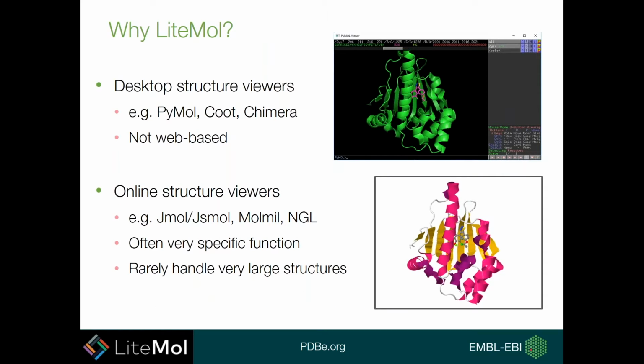So why might you want to use Litemol? Well, there's obviously a plethora of different structure viewers, and there are a number of desktop structure viewers that are very powerful, programs like PyMol, Coot, and Chimera. And the main problem with these is that they aren't web-based. These require download onto your desktop.